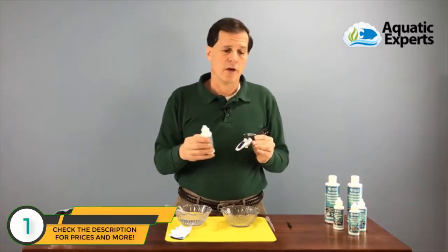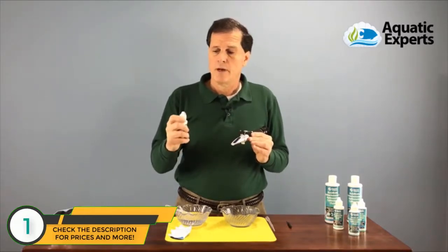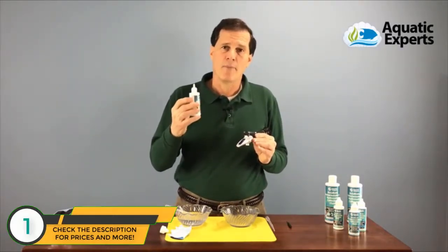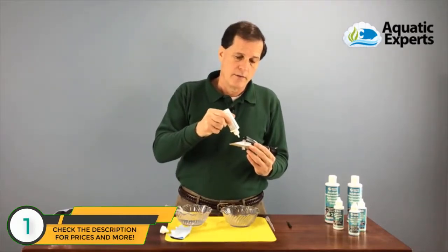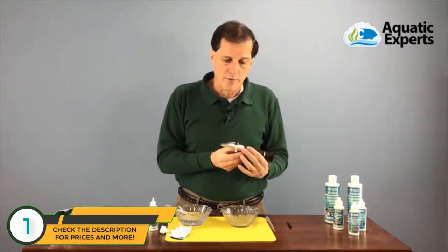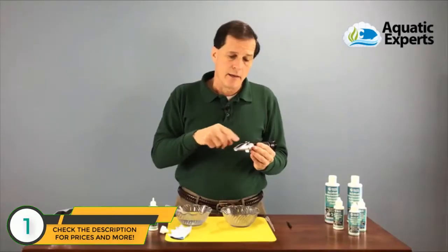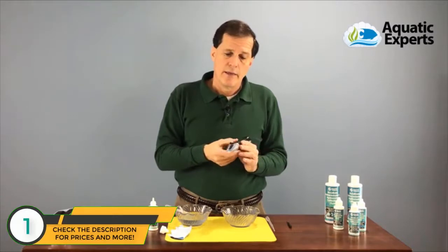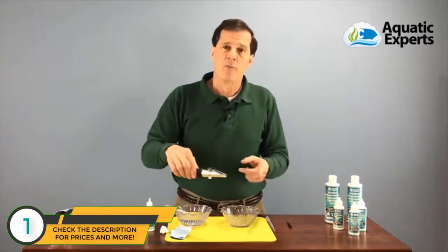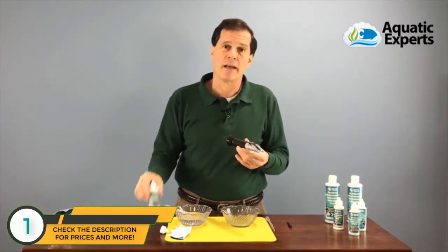Now I'm going to use my calibration solution to calibrate my refractometer. I'll shake it first to make sure it's well mixed, then add two to three drops to my prism and close the lid. I want to make sure there are no bubbles or air pockets — if there are, I'll add another drop to ensure it's completely covered. Normally I'd set it down for one to three minutes to equalize temperature, but in this case both have been sitting together for 30 to 40 minutes, so I know the temperatures are already the same.